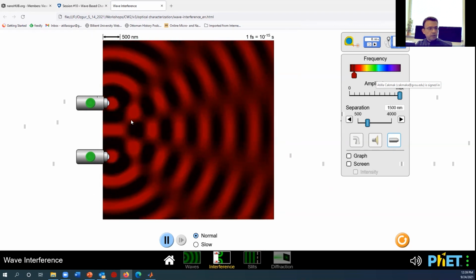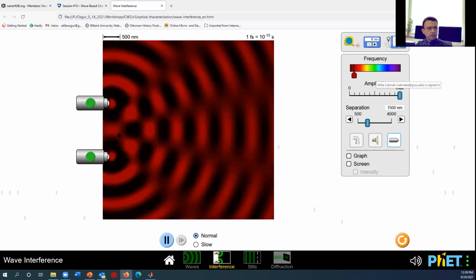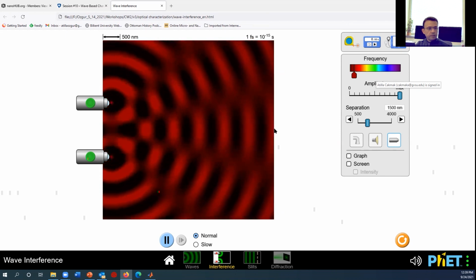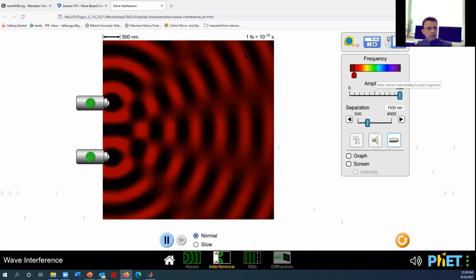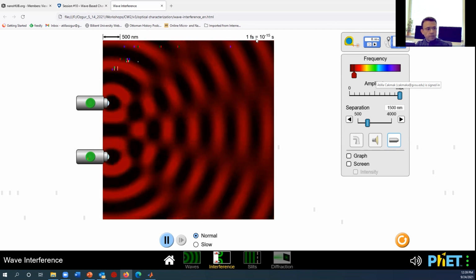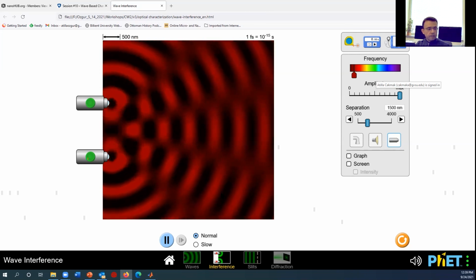I would like you to just take a look at it. Some of you are very familiar, I'm sure. Some of it may be a bit more new for some of you too. But we have these diffraction orders, like this is the 0th diffraction order. We have these symmetrical first diffraction orders. These are the surviving waves in a way that are coming out as a diffraction pattern, as you can see, symmetrically occurring.